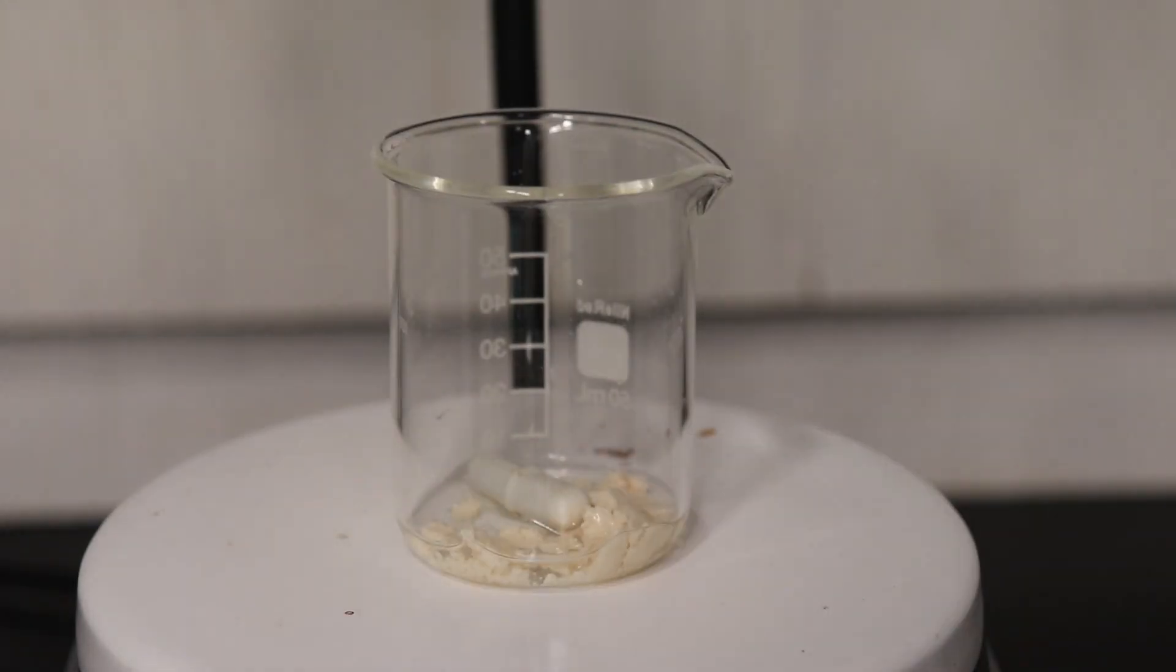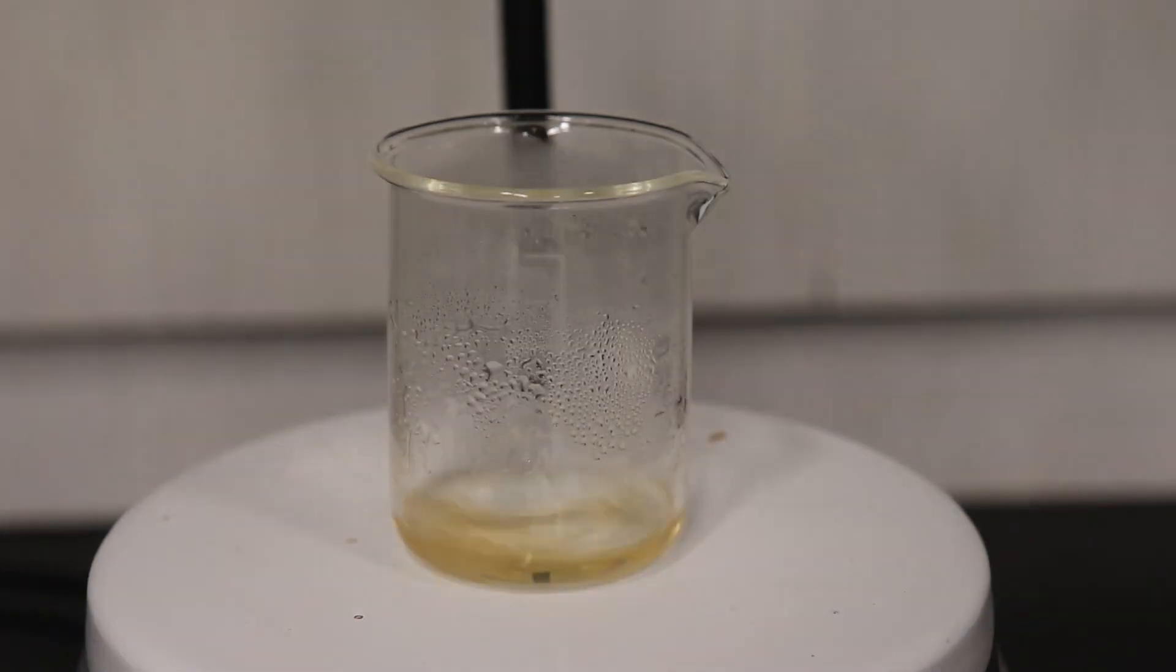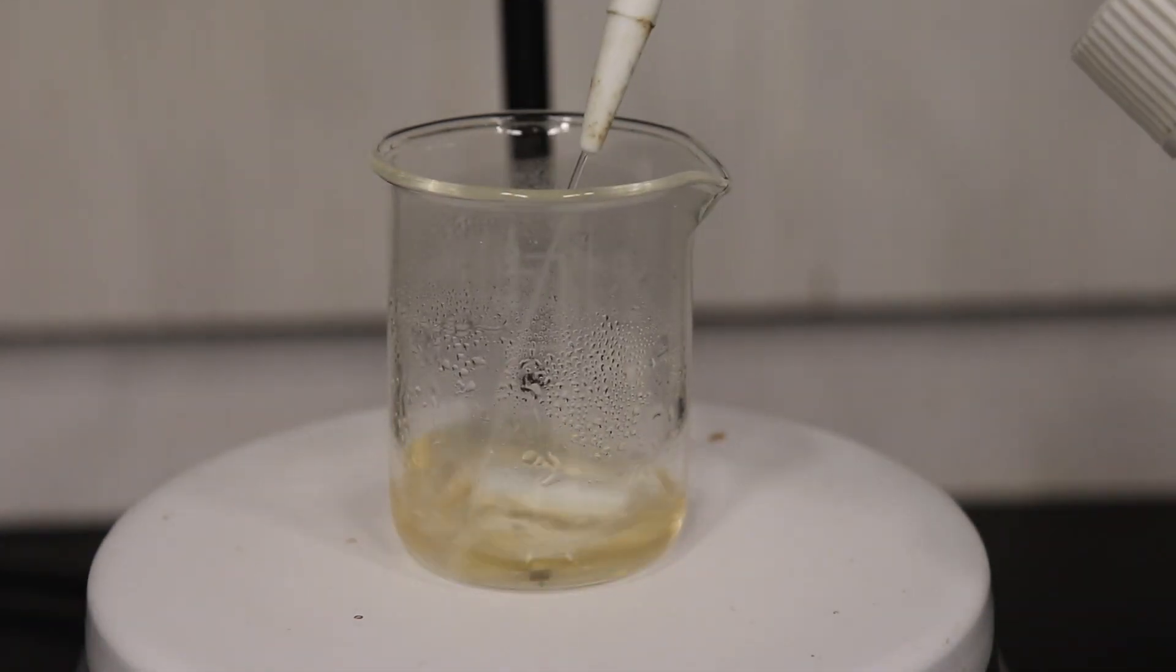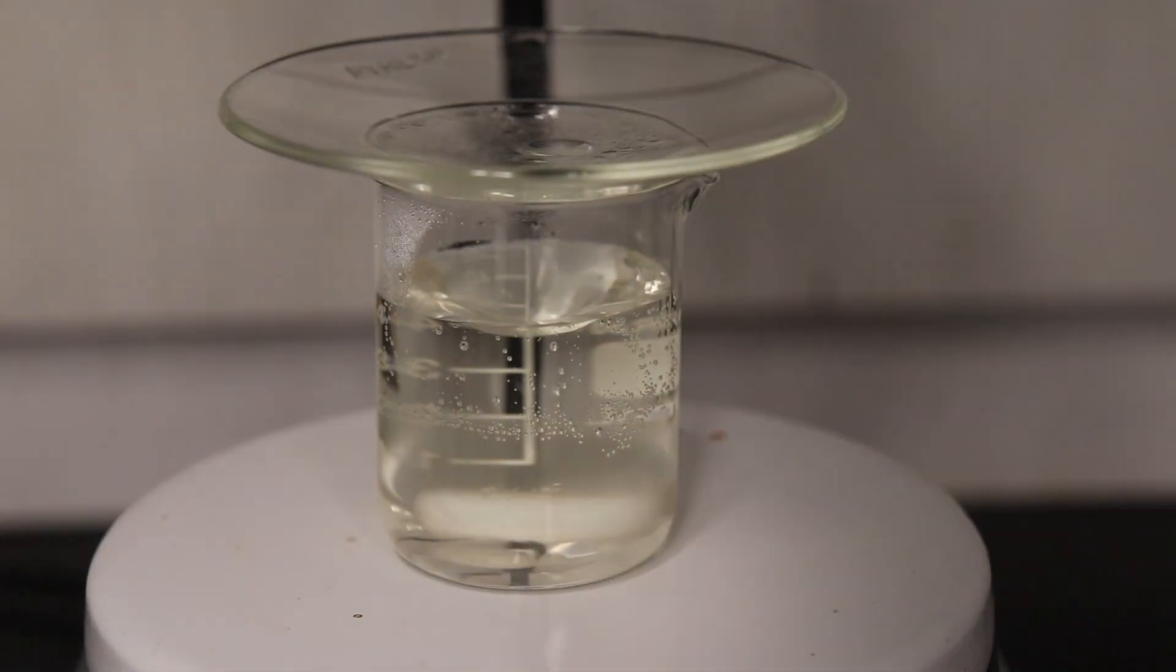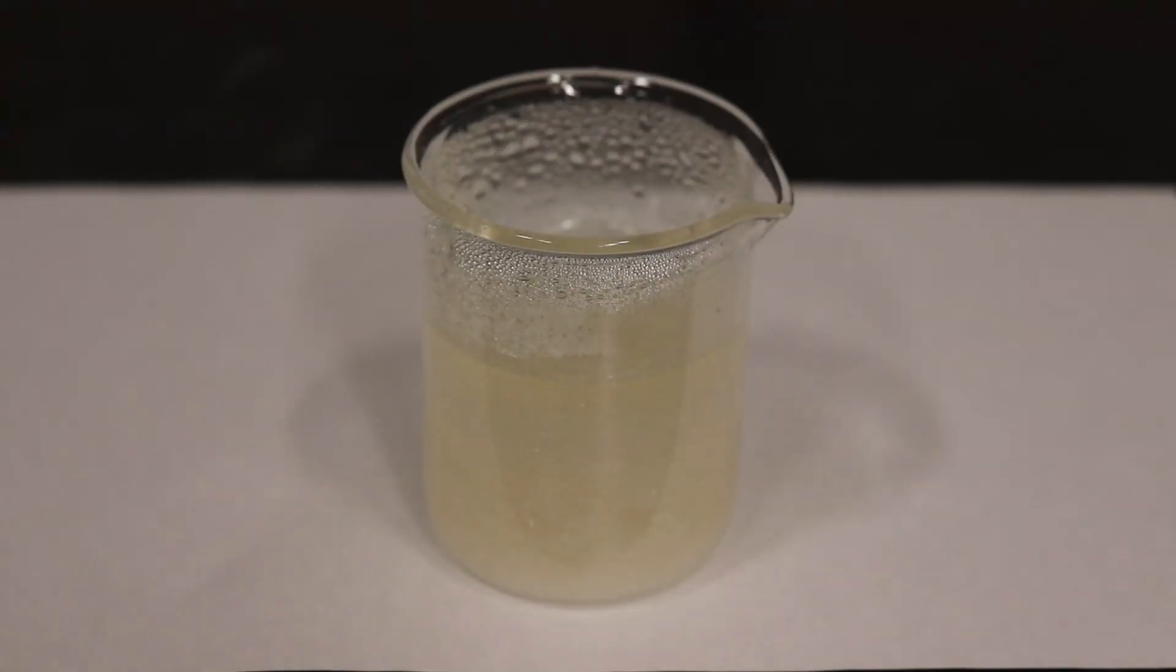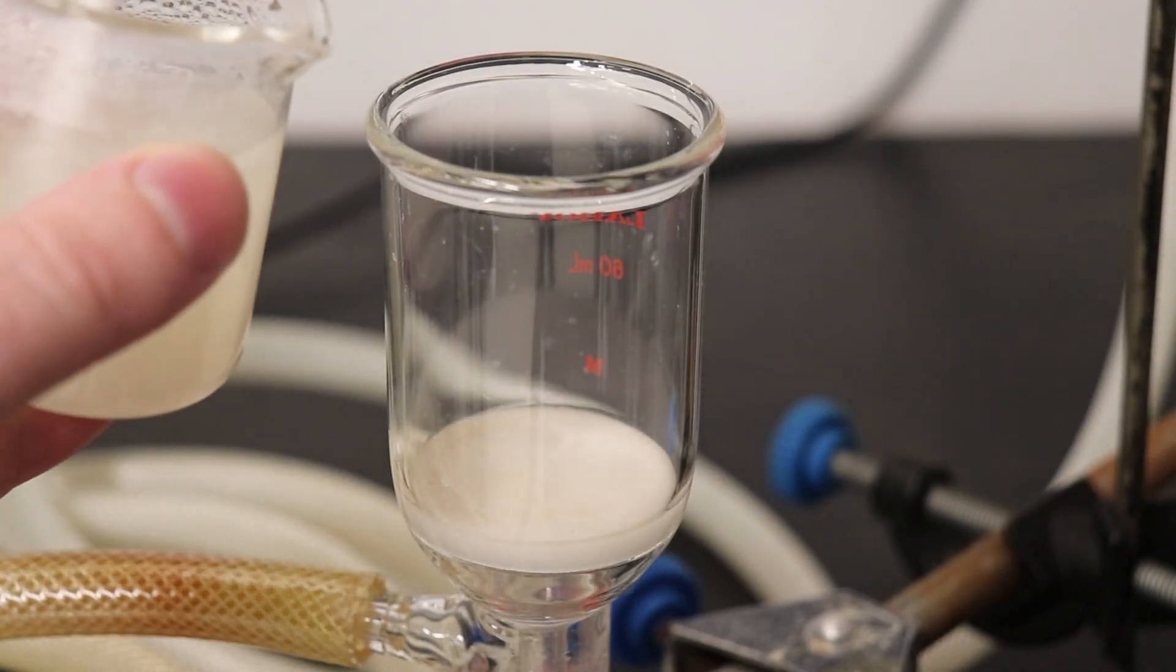I then recrystallized the product from hot ethanol and water, and in total I ended up using about 50 ml of 10% ethanol. The hot solution was allowed to cool slowly to room temperature before being placed in the fridge to cool down further.